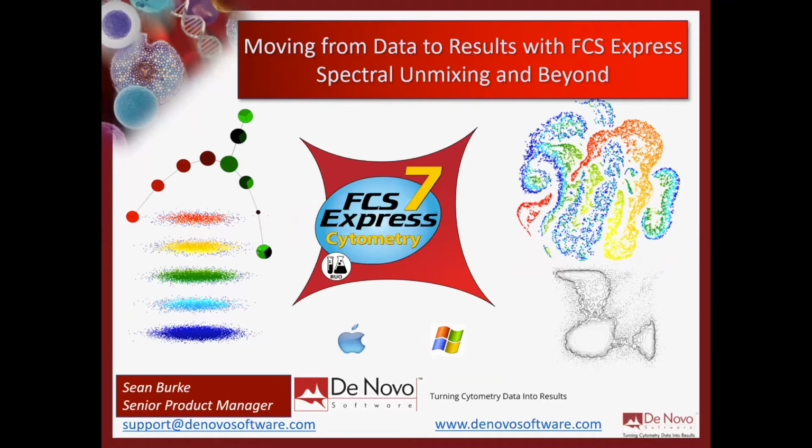So I'm going to pick up on the spectral data analysis a little bit here, talking about working in third-party software like FCS Express. But we're also going to talk about the context of not just getting basic plots and statistics, but what FCS Express can do, and that's the "and beyond" in the title of this talk.